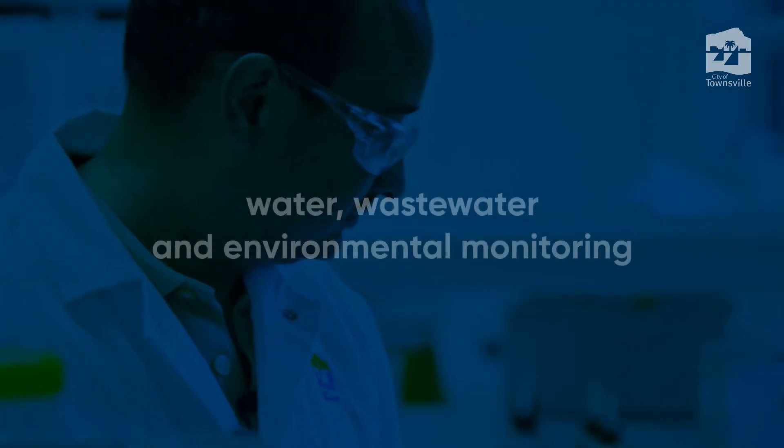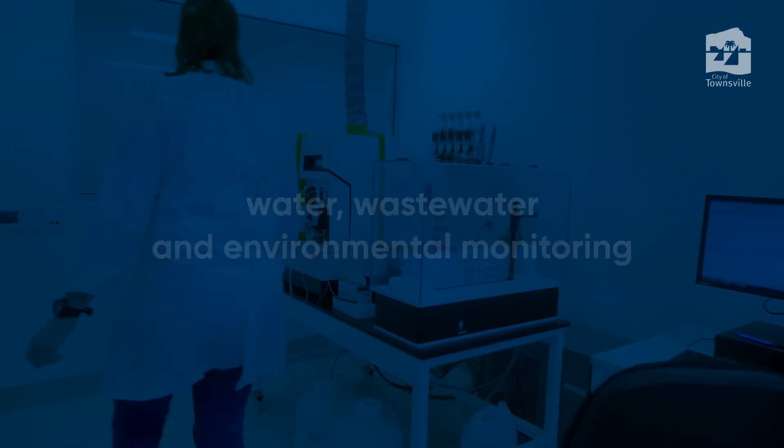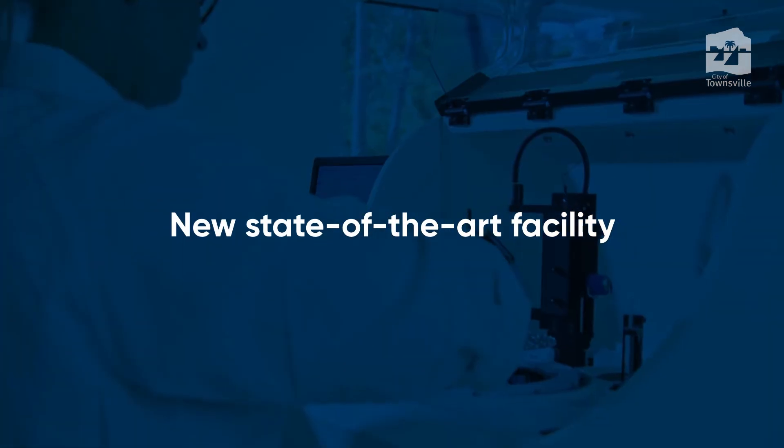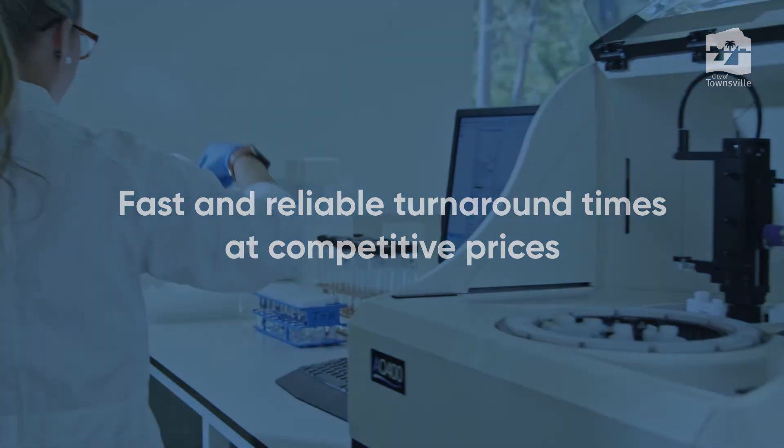Lab services can tailor the analysis to our clients' specific water, wastewater and environmental monitoring requirements. With a new state-of-the-art facility we can guarantee fast and reliable turnaround times at competitive prices.